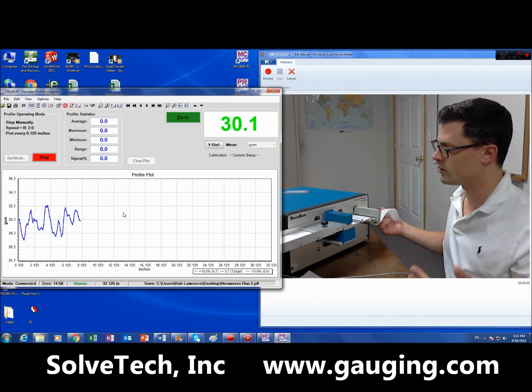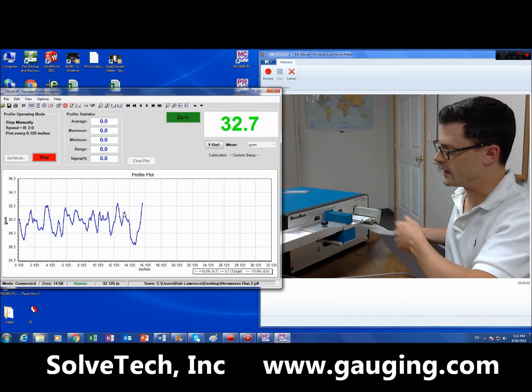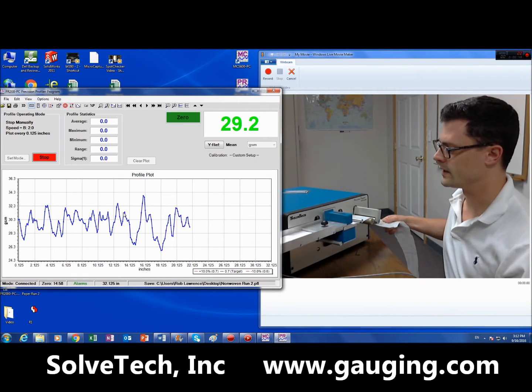I'm running right now — it just pulls it through automatically. I'm just making sure it doesn't get caught in the roller, and it's flattening itself automatically as it comes right through the gauge head.